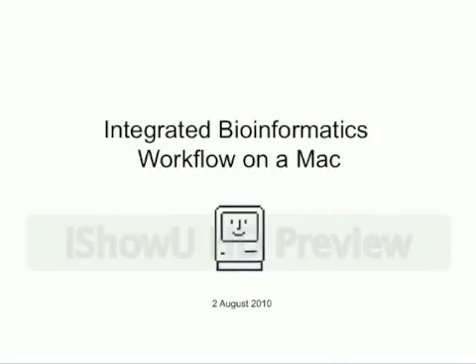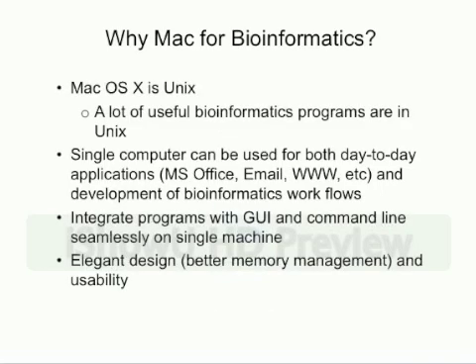Today we'll do, instead of a class, a demonstration of what a Mac can do for bioinformatics. Usually people are scared of bioinformatics, but there's nothing to be scared of. It can even run on a Mac, it's a smiling Mac. Okay, you might ask why you want to use a Mac.